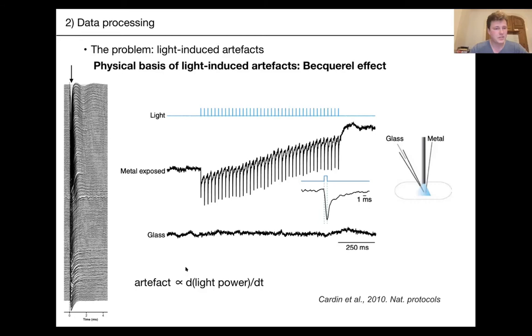This slide covers the physical basis of light-induced artifacts, called the Becquerel or photovoltaic effect. You can see in a 2010 Nature Protocols paper that shining light on a metal electrode triggers artifacts, but much less so on glass. This is due to the interaction between light and the metallic structure of your electrodes, and Neuropixels probes are really sensitive to these artifacts.